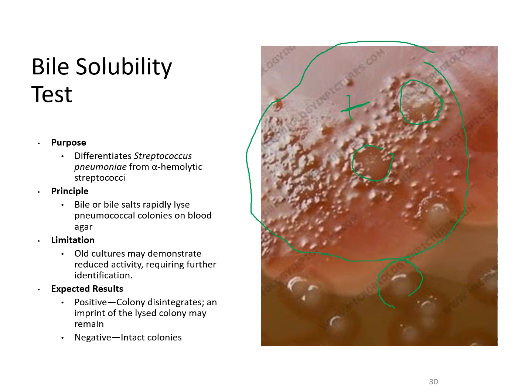And then of course if you were to drop it on the colony and the colony remained, then that's considered negative. So these two here together side by side, you don't have a negative on the plate. Down here it's just where the reagent has not come in contact with those colonies.